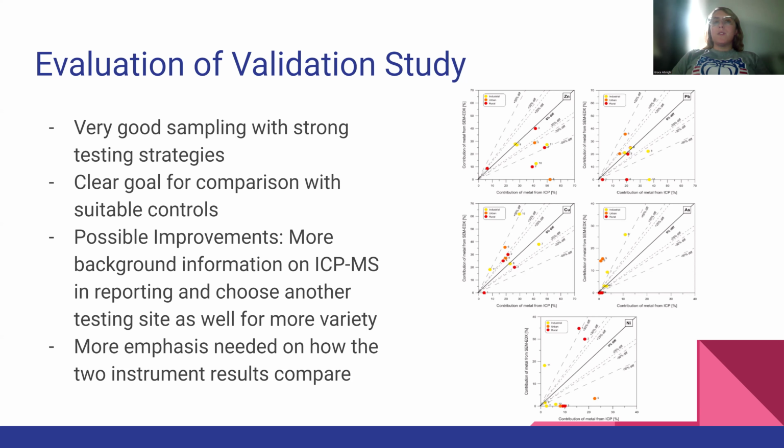Also, I thought that some more emphasis was needed on how the two instruments' results compared. The only real comparison that was provided between the two of them was these graphs that are presented on this slide right here. And as you can see through these graphs, they do show that SEM EDX and the ICP data create a very similar correlation line, and when combined, it does help to prove that SEM EDX is a comparable or a viable method for testing for particulate matter.